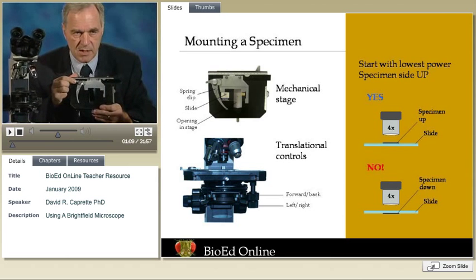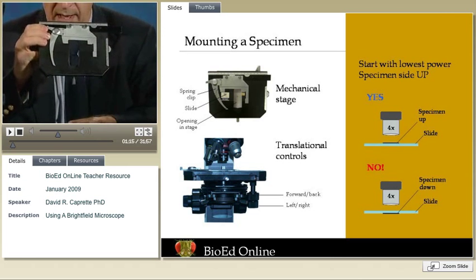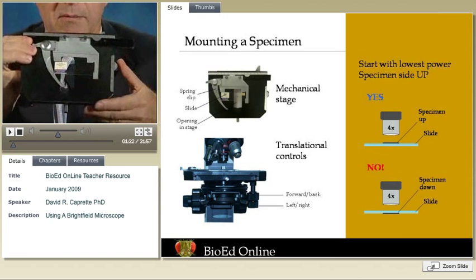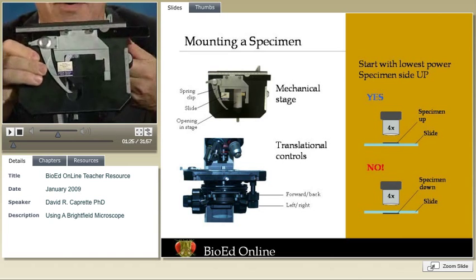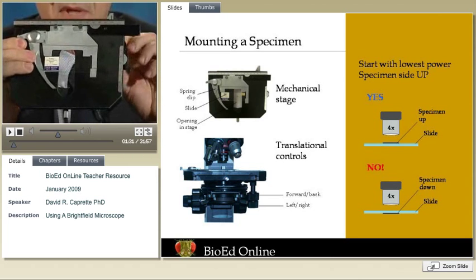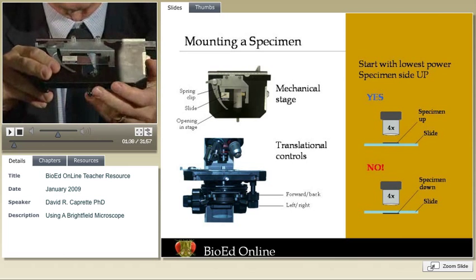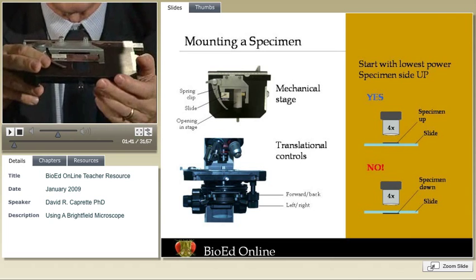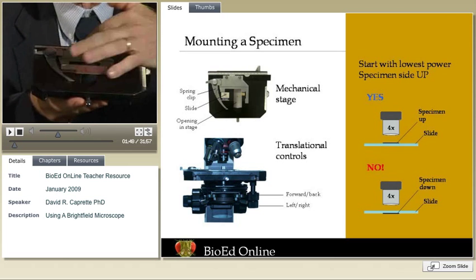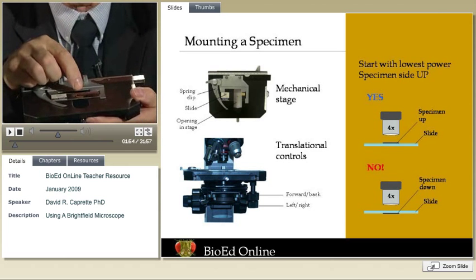The slides fit on the stage — on this type of stage — flat, and they're held in place loosely by a spring clip. This particular slide has a label on it. We pop it in there, hold it in place, and now we can move it around by using the mechanical controls. This particular slide has a cover slip, and I've put the cover slip in the up direction. It kind of makes sense to do that because if you move the slide back and forth across the stage, you don't want the cover slip scraping on the bottom. But there's an even more compelling reason for putting the specimen on top.